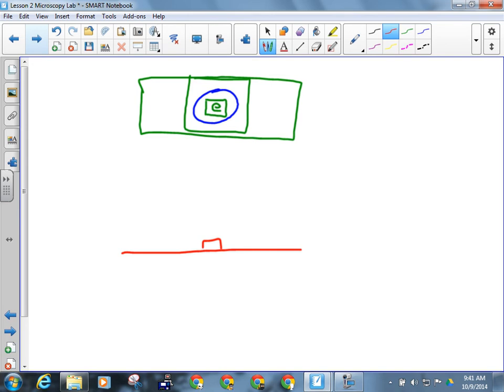Once you've got that, you'll kind of have a bubble of water in your letter E. Once the letter E soaks up the water, it'll sink. Then you're going to take what's called a cover slip, which is a small little square piece of plastic. You do have to be careful with these. I've had people cut themselves on them. They're that thin that you can actually slice yourself pretty good if you're fooling around with the edges of them.